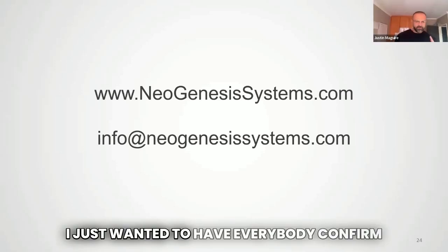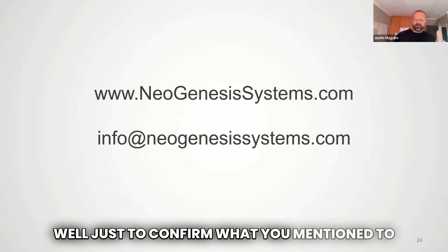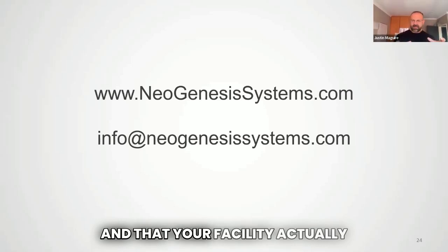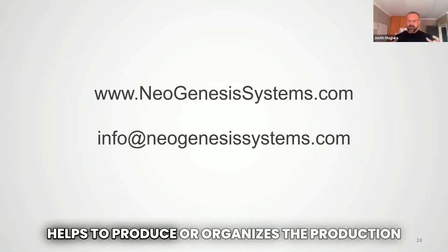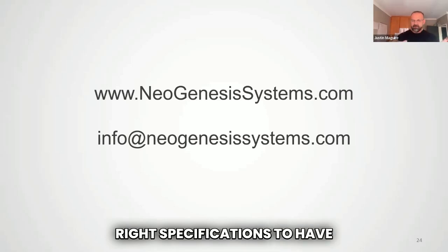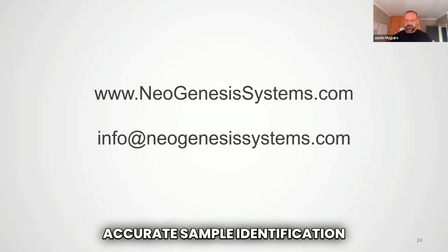I just wanted to confirm what you mentioned to everybody around the microscopes, and that your facility actually helps to produce, or organizes the production at least, of the microscopes to meet the right specifications to have accurate sample identification.